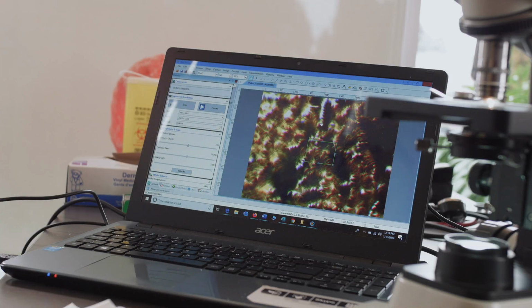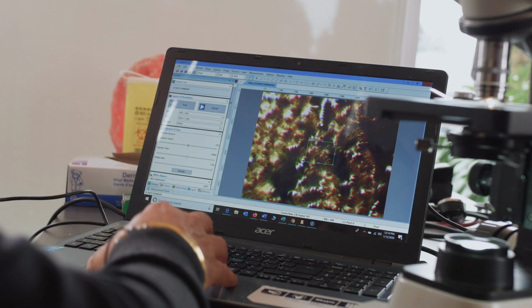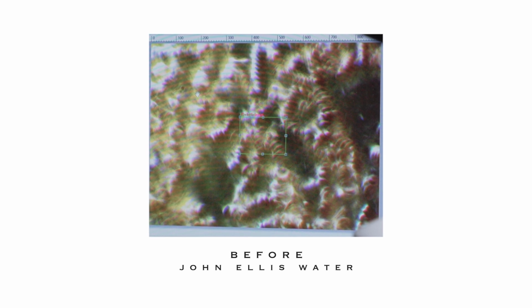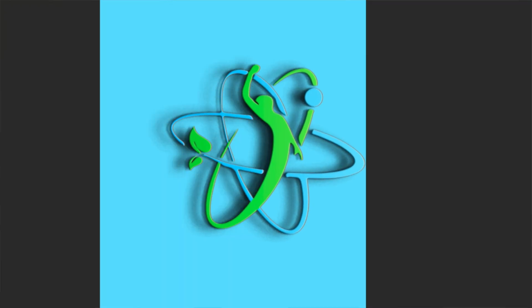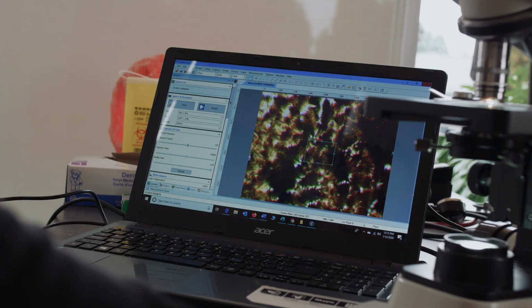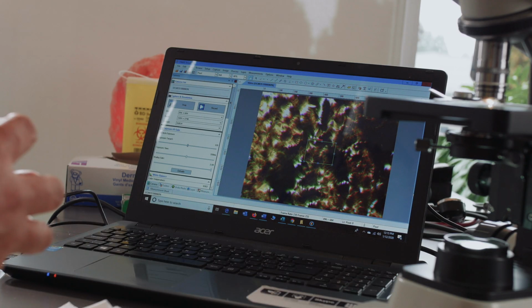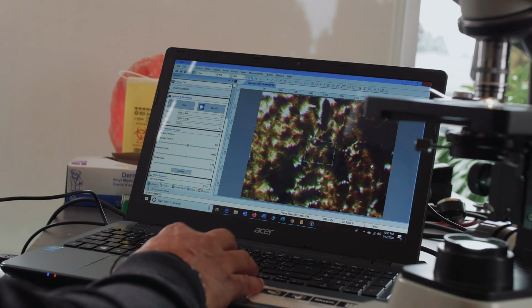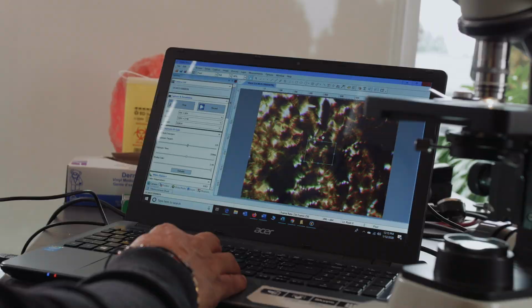So what this refers to as a rouleau formation, it can indicate when the surface area of the cells is reduced quite significantly down here. Often when we see this, it can be a result of pH imbalance within the body. We should get nice individual cells freely floating around, spherical shapes. And down here, we're getting a lot of accumulation of cells.